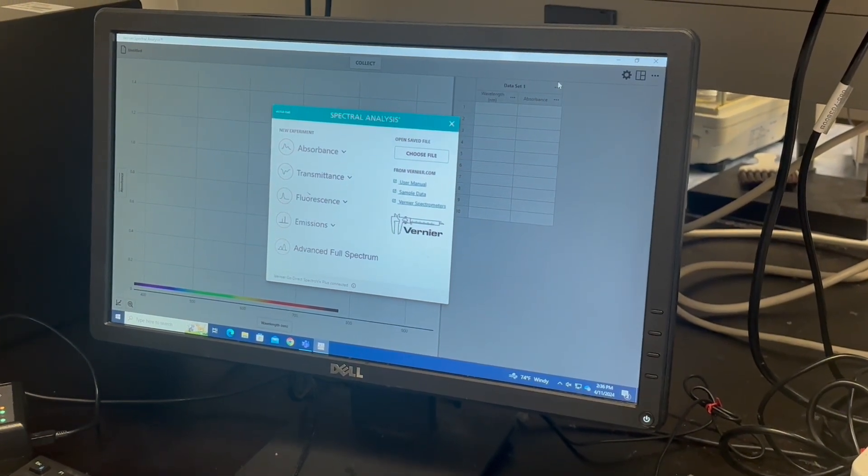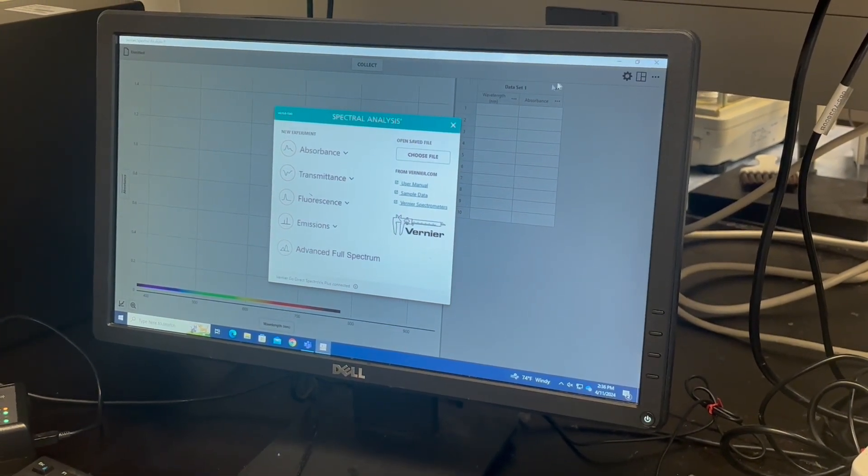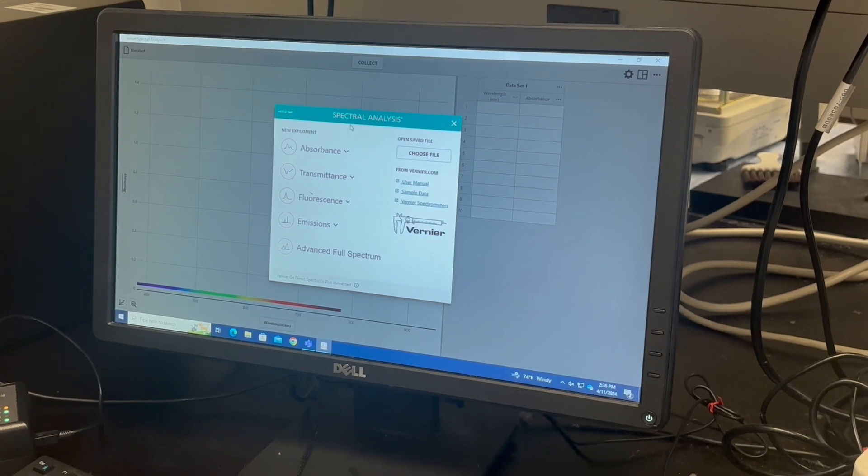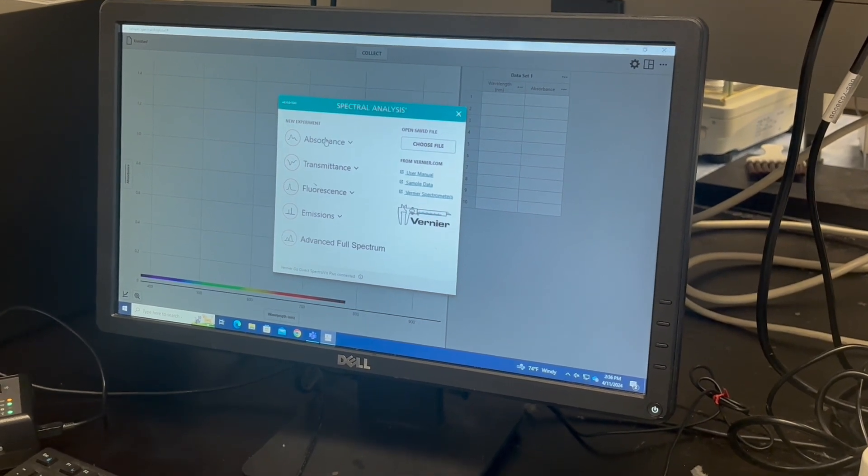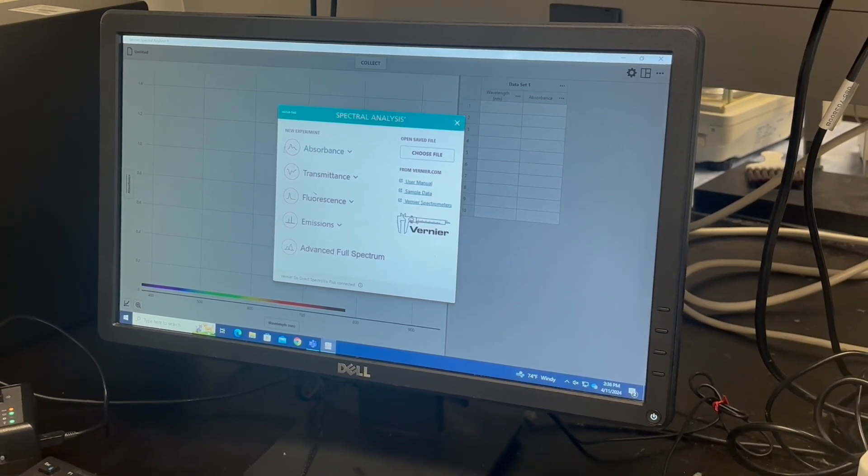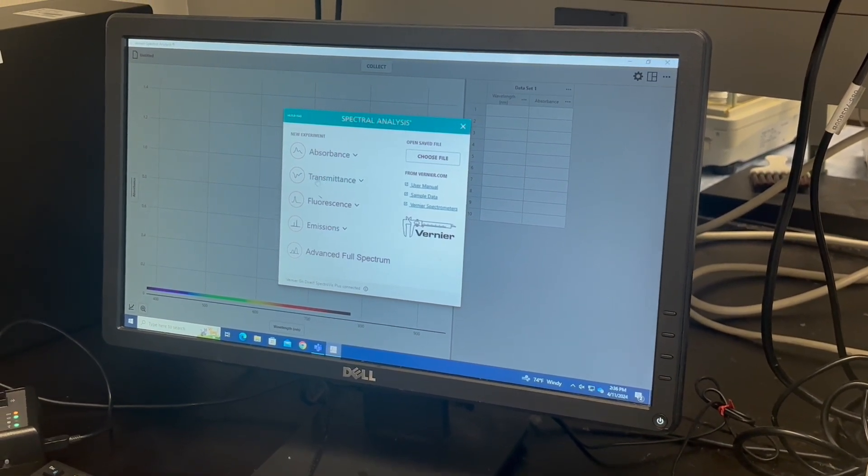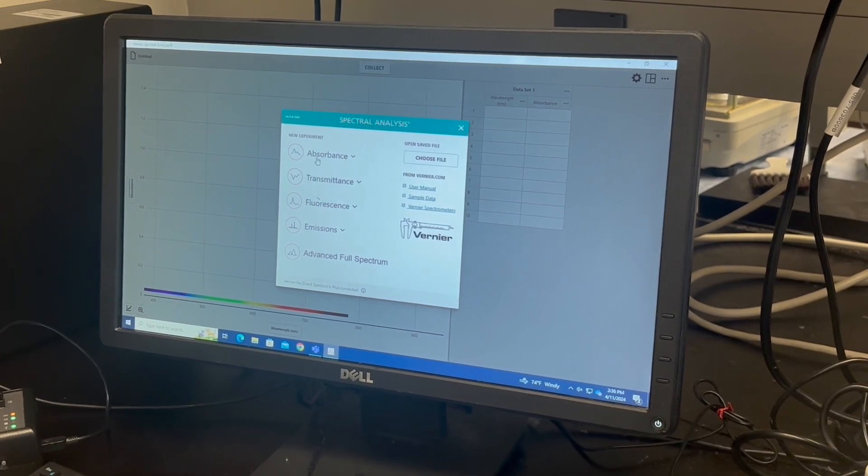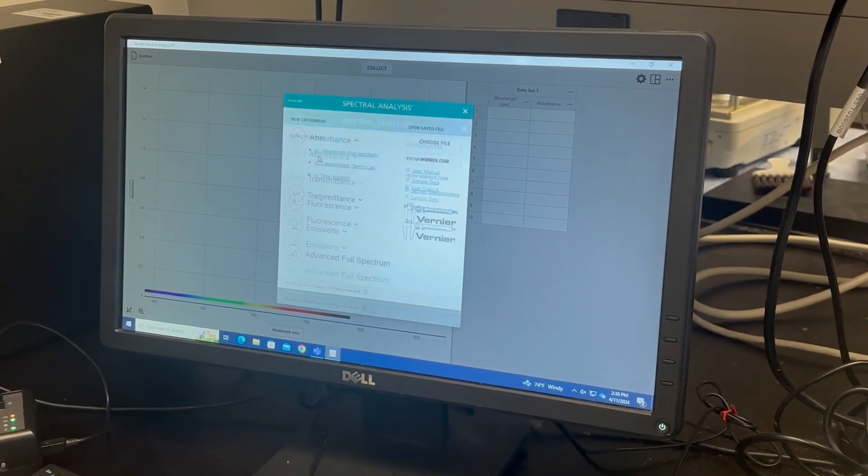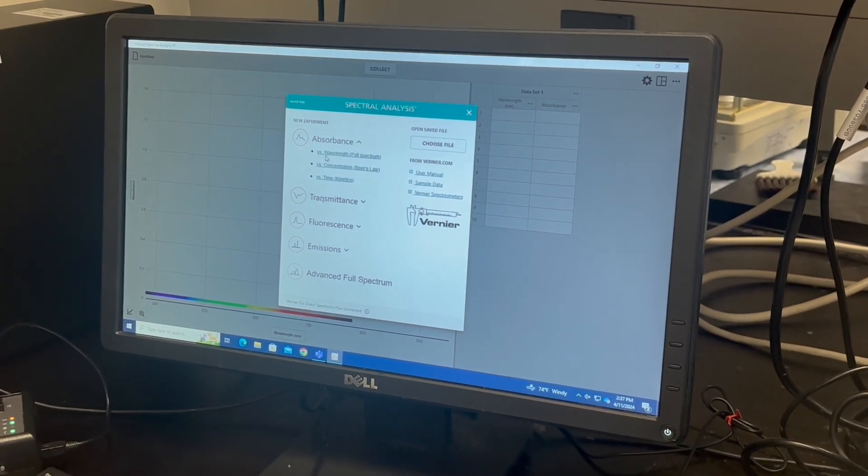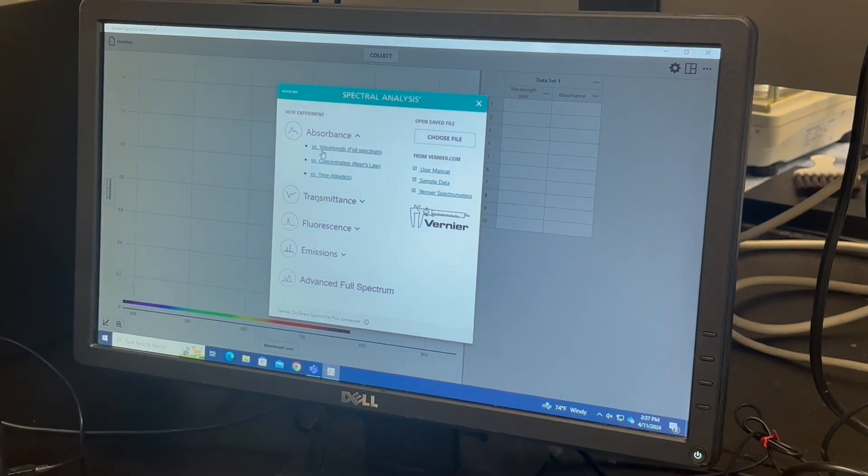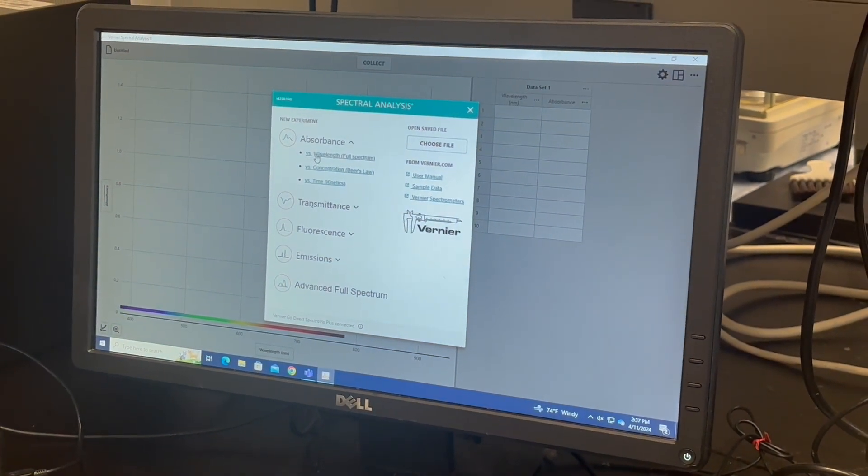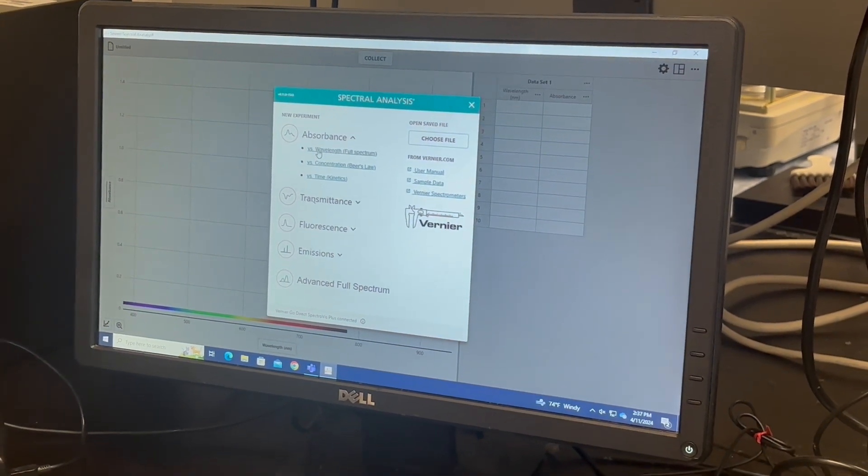And then, depending on your experiment, for the inorganic lab you'll be using the absorbance. But sometimes you may need the transmittance or the fluorescence. We'll start here. And then we'll do versus wavelength just to see the full spectrum.